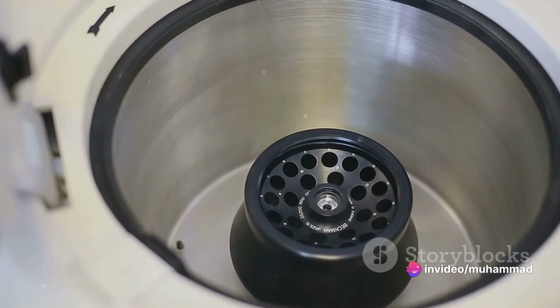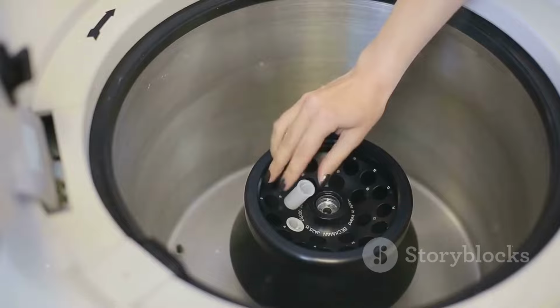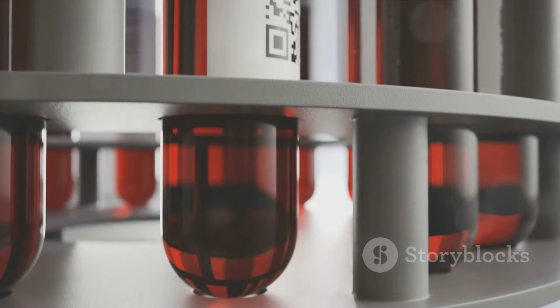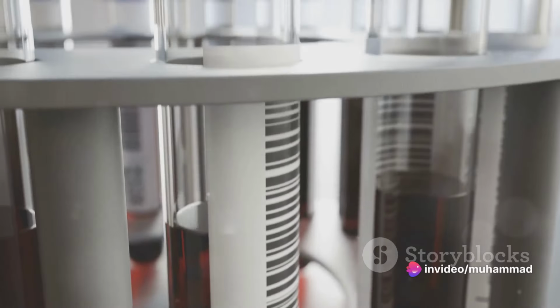cellular components. The homogenate is placed in a liquid with a gradient of densities and then spun at high speed. The various cellular components position themselves at the level where their density equals that of the surrounding liquid.